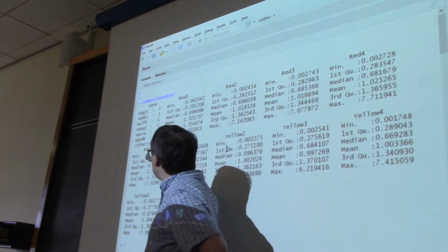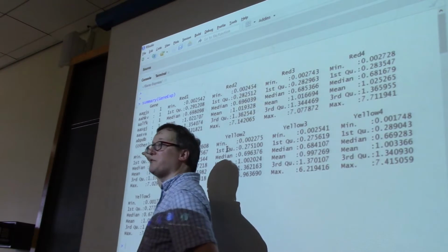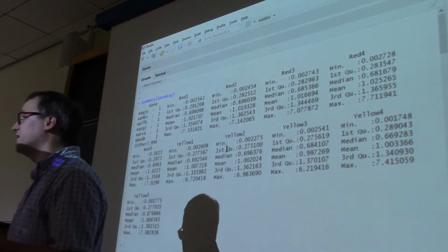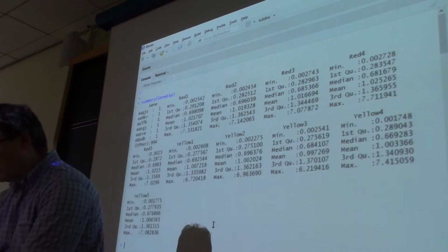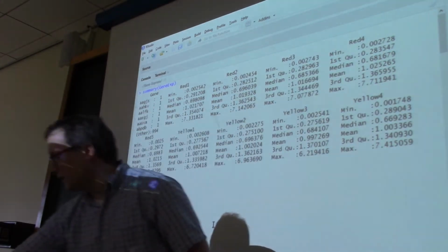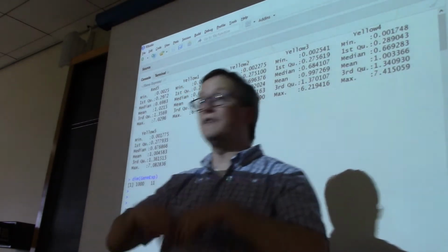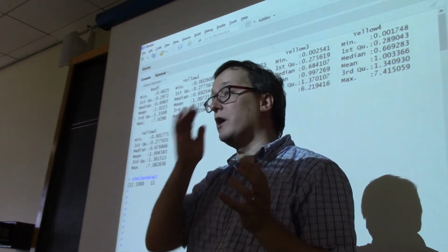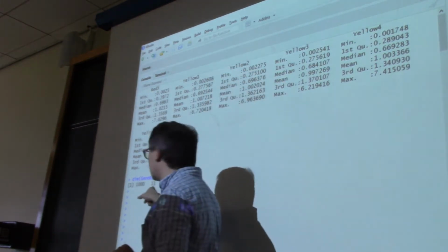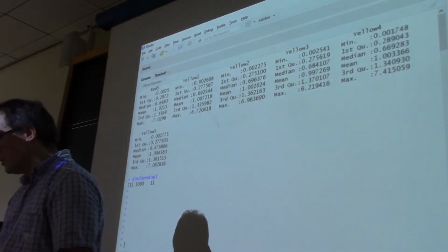You can see that there are 1,000 distinct gene names here because we have 1, 2, 3, 4, 5, 6, plus another 994 of them. But there are definitely nicer ways to see whether this gene expression object has everything in it that we expected. So one of the simplest there would be the dim command. When we run dim on the gene expression object, we see that we have 1,000 rows and 11 columns. And whenever you're dealing with a table in R, keep in mind that the first number is how many rows, and the second is always going to be how many columns. So we have 10 expression values plus 1 that's a header. Grand, we're in a good place so far. Now let's return to our source code to see what we're doing next.